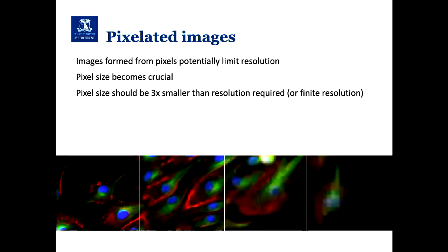So here, for example, this is probably a little bit more than 9 by 9. We can clearly see that these are nuclei, whereas this is probably at or a little bit below 9. You'd be struggling to say whether or not that was a nucleus or not. This brings up the question of what is the resolution that we're getting off our systems.